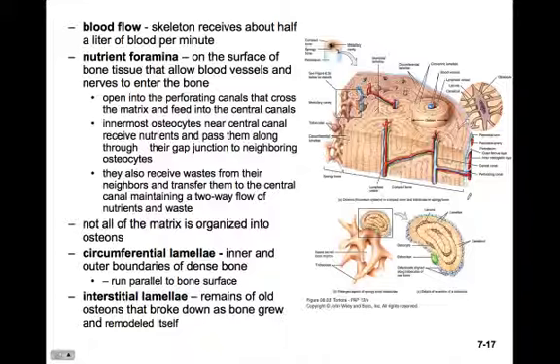You can see, although this is spongy bone, you can see the idea here, where you have a little osteocyte inside a lacunae, and each of its projections are reaching out through these little canaliculi, the little canals in the bone, so that this cell might be able to talk to this cell.